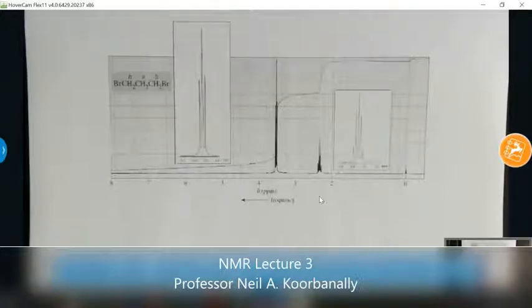The first thing that I want to bring to your attention is that in some spectra, you probably see this integration line that you see here. This used to be the old way of looking at the spectra. We used to see these integration lines. These days, what we find is that the integration is recorded at the bottom here. And I'll show you just now how to calculate these integrations from this curve.